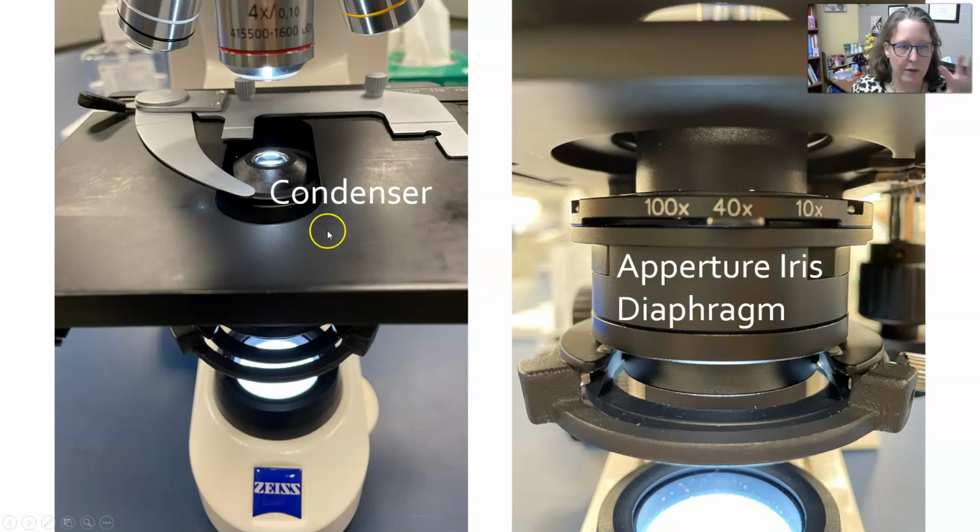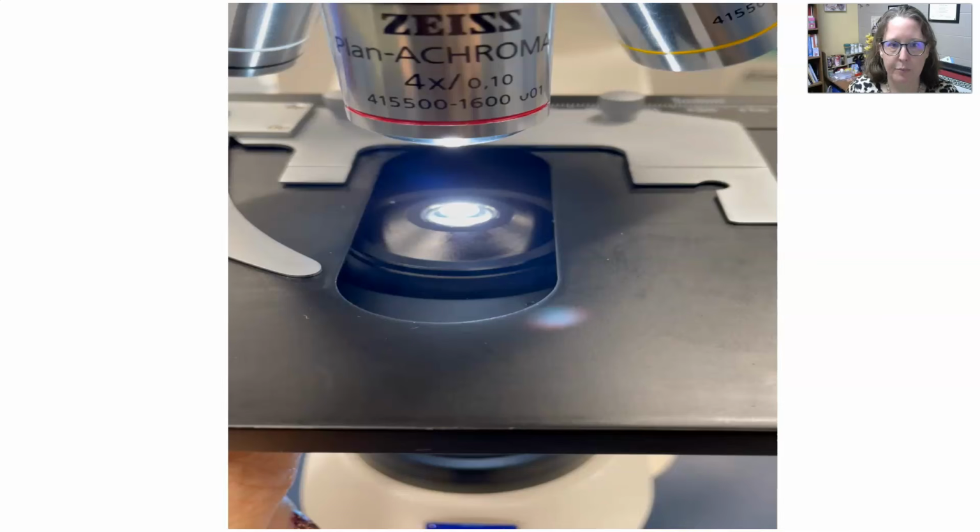So if you look at it from the top of the stage, this is the condenser that you see here shining underneath your slide, if your slide is placed right here. And then here's a zoom in of the aperture iris diaphragm. You see the little lever. It's set on 40 right now, but if you were at 10x, you could go there and it would be less bright. And if you are at 100x, you could go there, and that's completely opened with the maximum amount of light coming through.